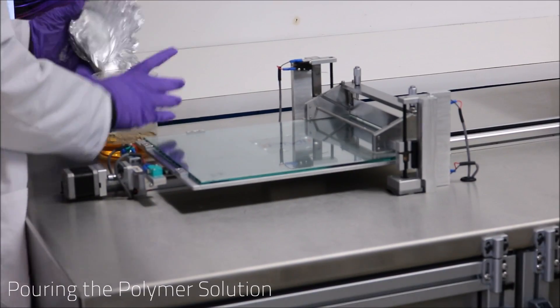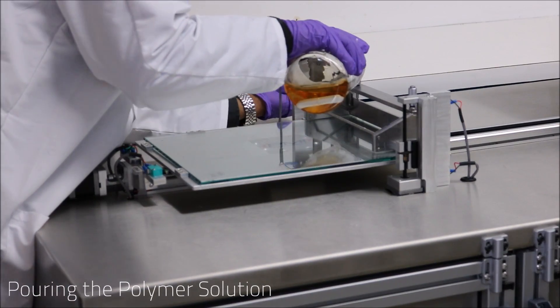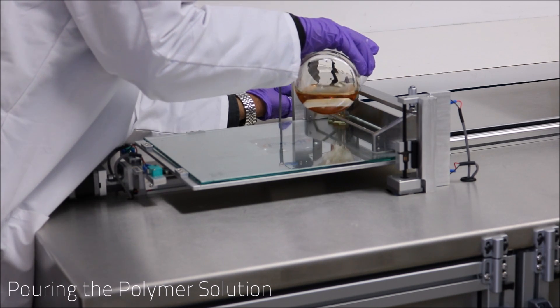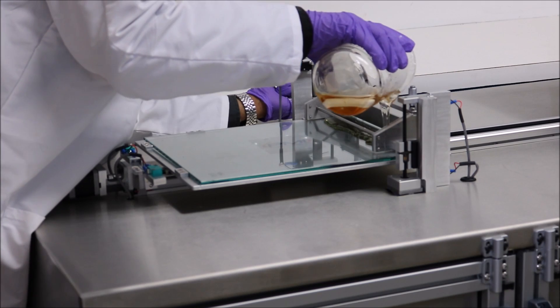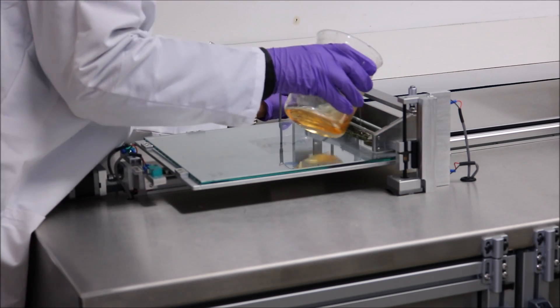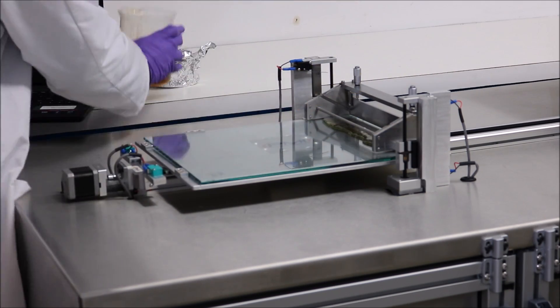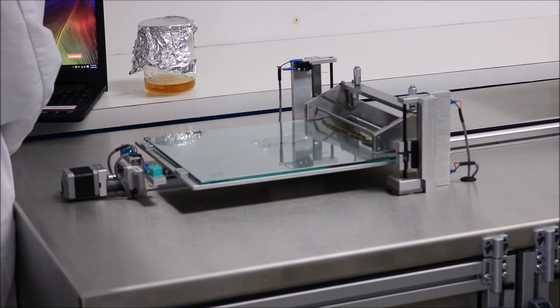Now that we have the thickness set, we can now begin pouring the polymer solution onto the membrane casting plate. For the best results, it is important to pour the polymer solution as close to the doctor's blade as possible while maintaining an even line.